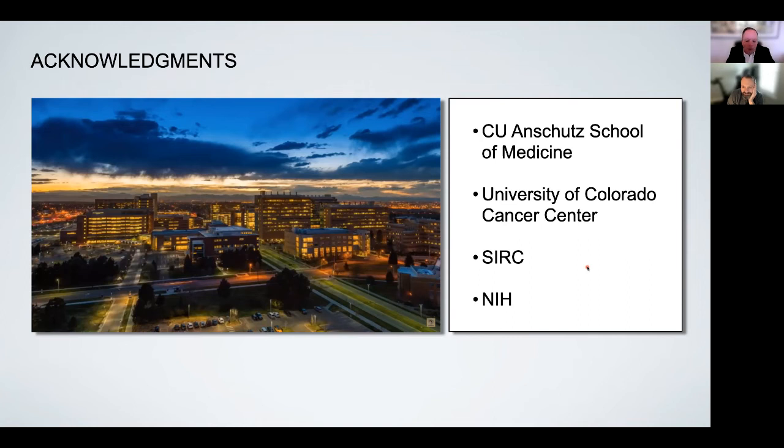No, that is a great question, and EM would be the perfect technique for that, depending on the size of your complexes and the stability of the interaction. So let me explain a little bit more. CryoEM can detect particles in the lower size range of about perhaps 50 to 100 kilodaltons.